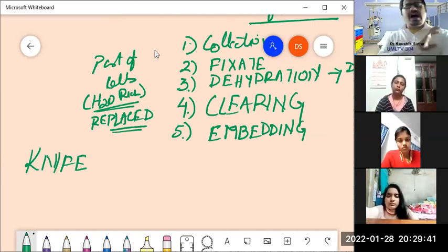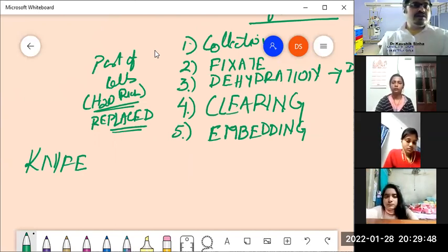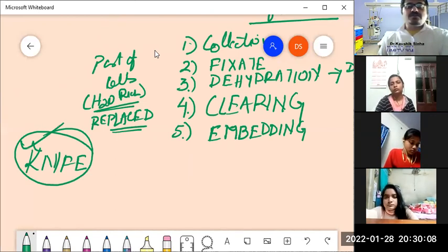No matter how sharp a knife you use, a deformity can occur in any material that is soft. The fixation method induces some degree of toughness to the tissue, though that degree of toughness is not sufficient always to prevent the deformation that can be produced by the knife.